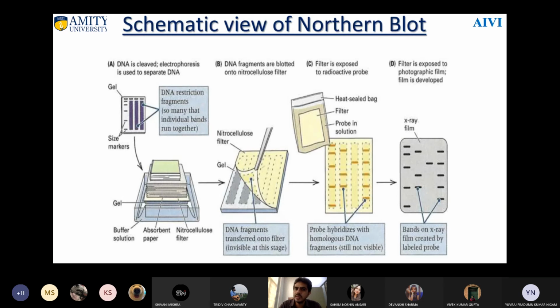Transfer from the polyacrylamide gel to your membrane is a bit difficult, because the pore size in polyacrylamide electrophoresis is very small, so capillary action won't allow migration of the particles through those small pores. In that case, we can use electro transfer or electro blotting rather than the normal capillary action blotting.